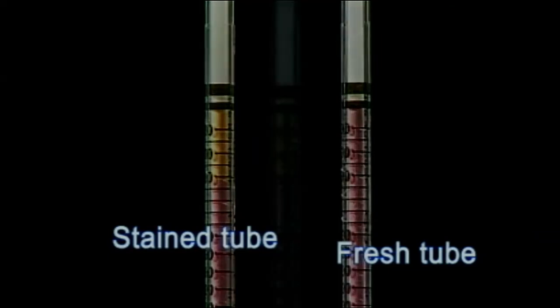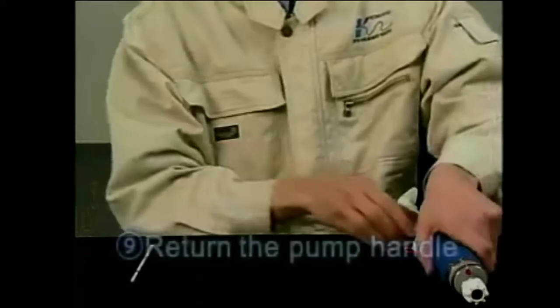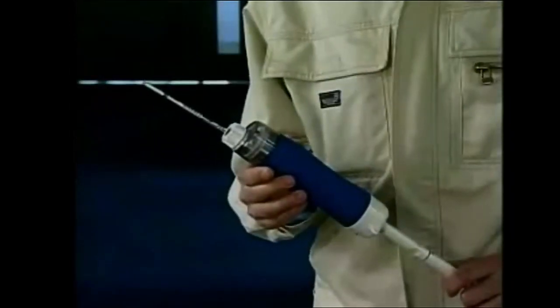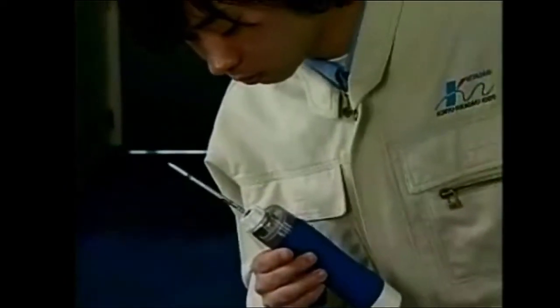If the end of the stain is between graduation marks, estimate the concentration. The concentration of carbon dioxide in this sample is approximately 500 ppm. Push the pump handle back into the pump so it is ready for your next measurement. This detector tube is so sensitive that it can detect carbon dioxide from your breath.